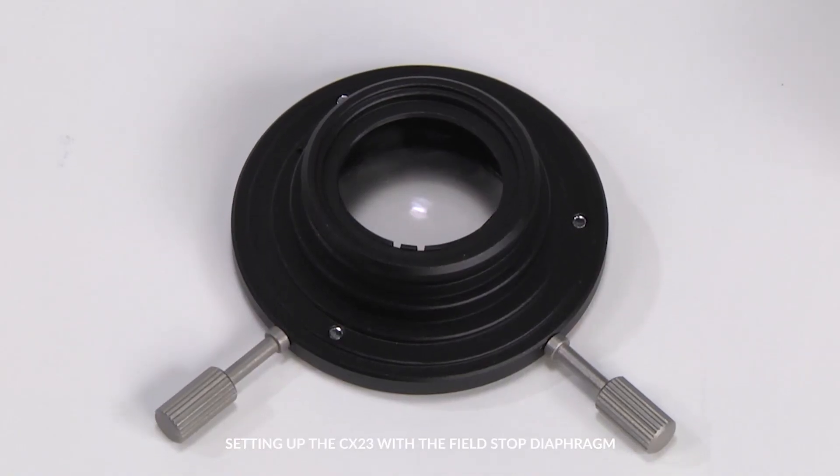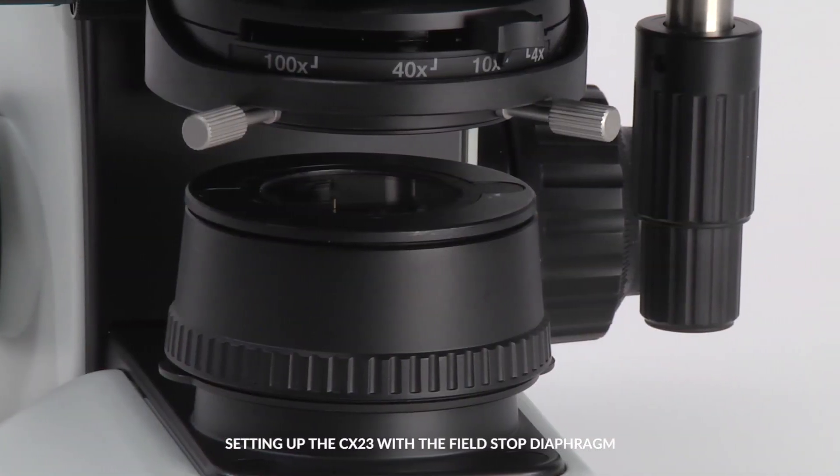Ensure that both centering knobs of the auxiliary lens unit match with the notch on the condenser.